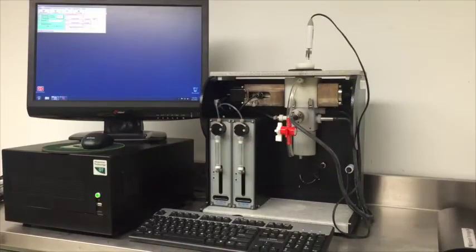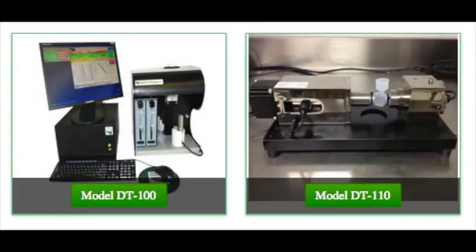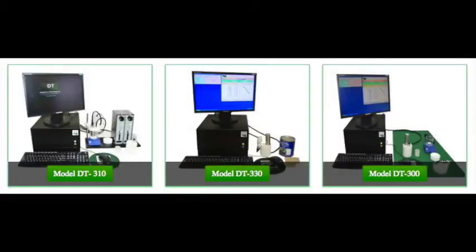Dispersion Technologies instruments come in various configurations and with various probes. Different setups are given different model numbers. What we have here is a DT1202, which is designed to measure both particle size and zeta potential. Instruments for solely particle size measurements are in the DT100 model line, and instruments which measure only zeta potential are in the DT300 model line. However, different probes and options, including those I mentioned earlier, can be included with any of those models.